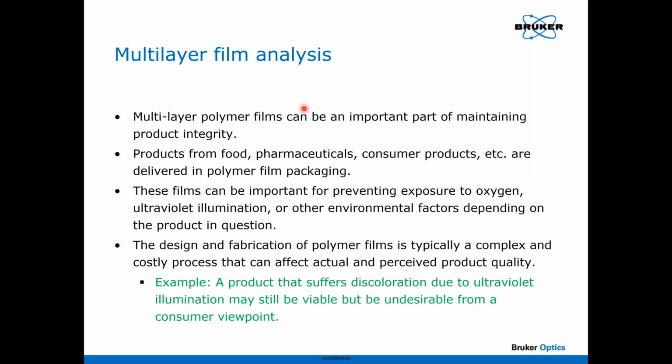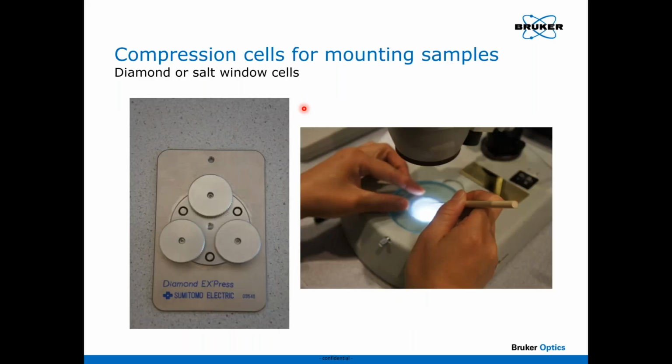And so the design and fabrication of these polymer films can be complex and very, very costly to do yourself, figuring out which ones adhere well to others and so forth, where if you just look at them, away you go. So let's go to the first one.